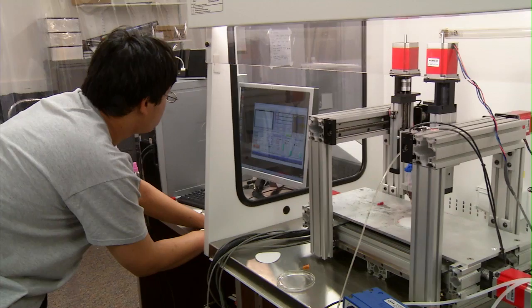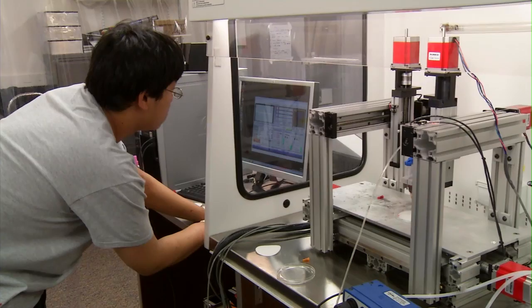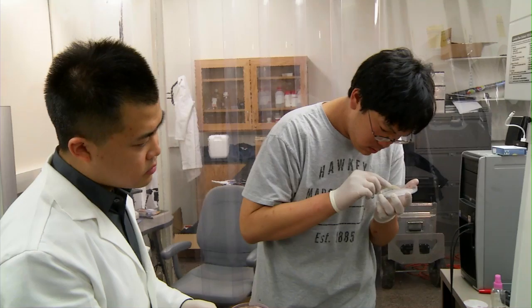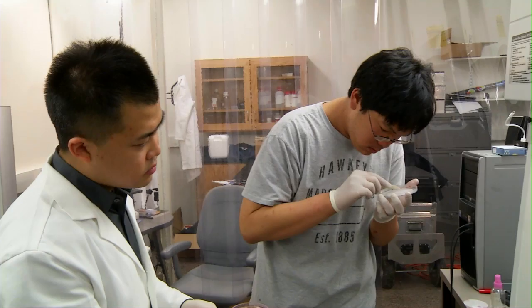Howard built the printer from the ground up, a task he thoroughly enjoyed. He just loves tinkering with things, playing with Legos when he was a little kid. You slowly graduate from Legos to building things out of metal, but that mindset never changes. It's just really cool to get paid to play with Legos all day long. And his work is on the forefront where science, technology, and medicine intersect.